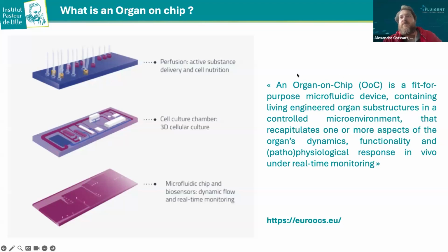which says that it's a fit for purpose microfluidic device that contains living engineered organ substructures in a controlled microenvironment, and that can recapitulate at least one feature of an organ, the dynamics, the functionality, and the response as observed in vivo, with the capacity to monitor it in real time.